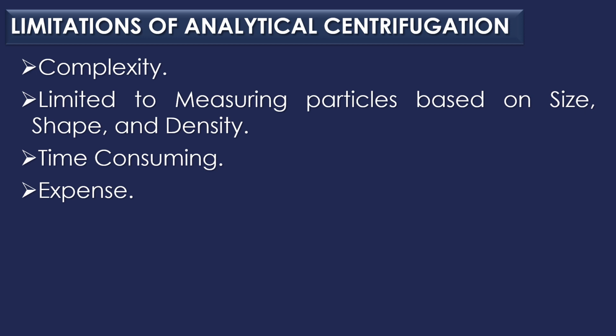The third limitation is time consuming. Analytical centrifugation techniques can be time consuming, particularly if multiple measurements are required. The fourth and final limitation is expense. Analytical centrifugation techniques require specialized equipment and consumables which can be expensive.